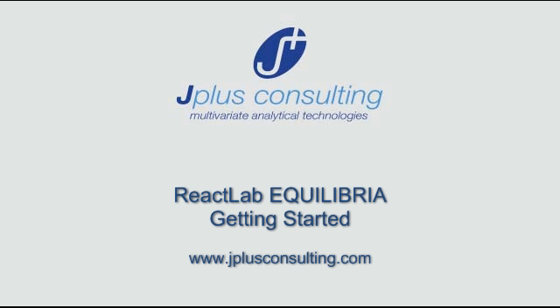ReactLab EQUILIBRIA is designed to analyze multi-wavelength spectroscopic measurements collected during automated or manual titration experiments. The aim is to quantitatively analyze the underlying reaction mechanisms to determine the equilibrium or formation constants for each step, as well as compute the spectra and concentration distributions of all the participating species.